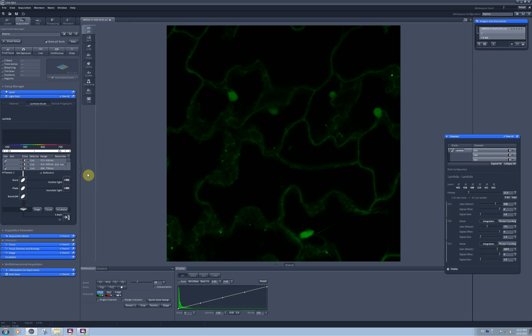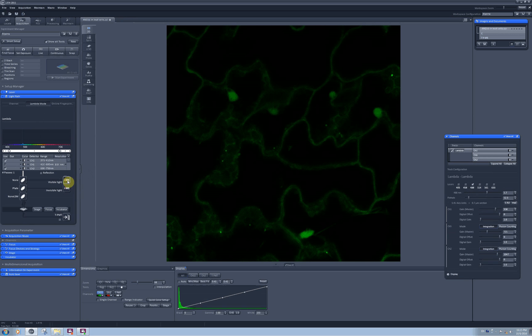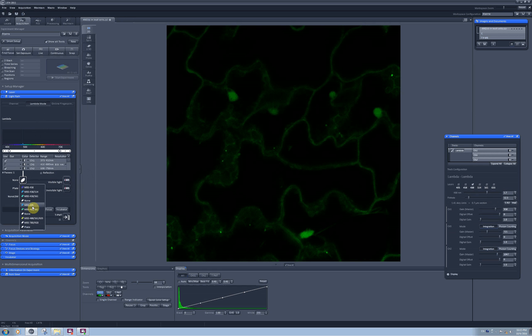Then I will proceed to activating the laser which I use for detection of GFP, 488 nm, and I need to make sure that the corresponding main beam splitter is in the path 488.